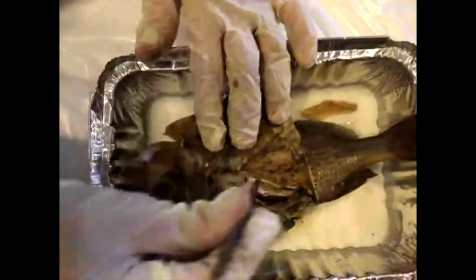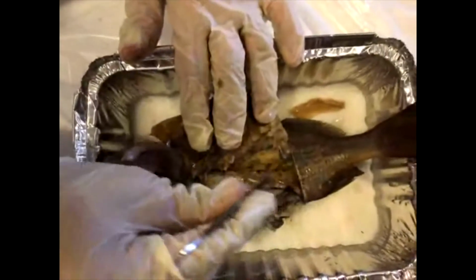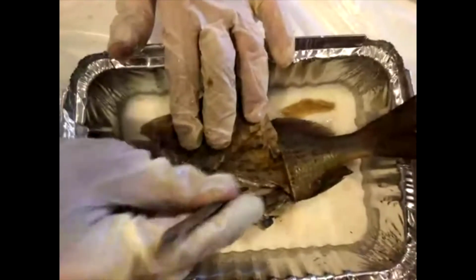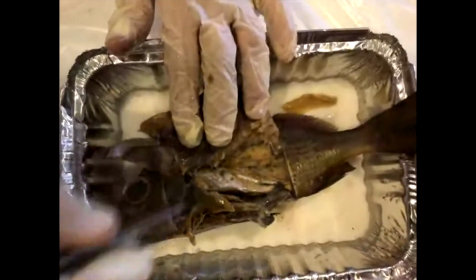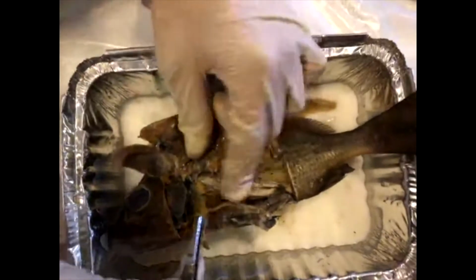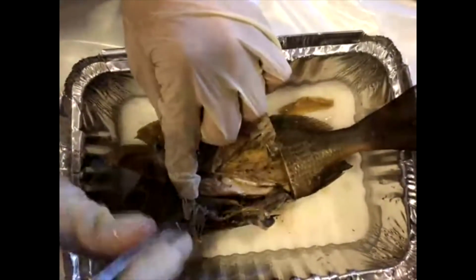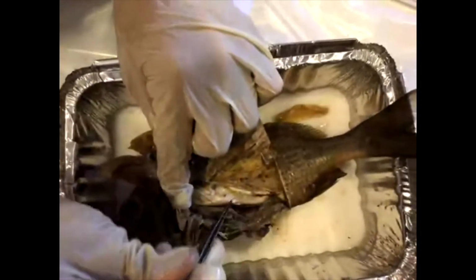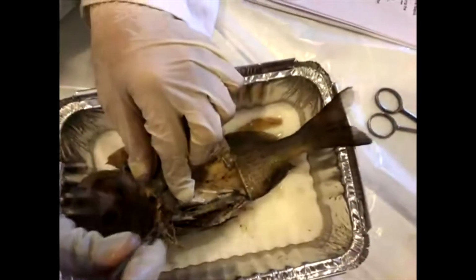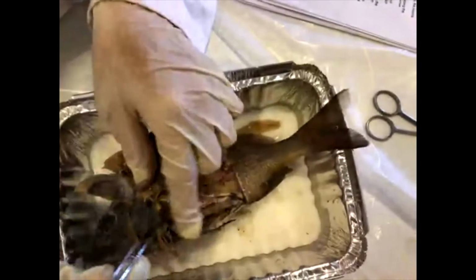So this is the swim bladder here in the back, and you can draw a rough outline on that. We are going to draw a few things over it if you want to follow along, but this is one of the largest organs that we're going to see. Okay, just going to do a quick peek in here, make sure I'm showing you the right things. So, yeah, we've got a few things going on here.